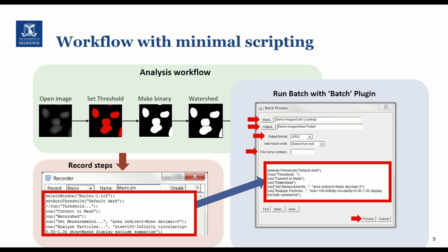We can also test on the first image of the input folder before running the entire batch process, and also we can save our scripts as a text file.